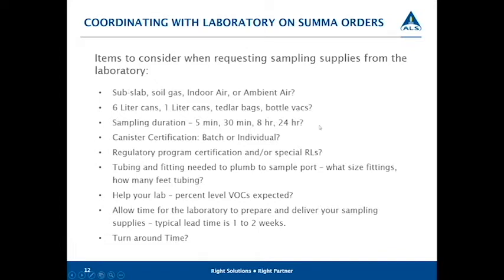So, coordinating with the laboratory on Summa orders, this is a slide that gives you all the items for consideration when requesting your sampling supplies from the laboratory. And I always say, if you take away anything from this presentation, this is the most important slide, because it has all of the information that the laboratory needs to know from the client.